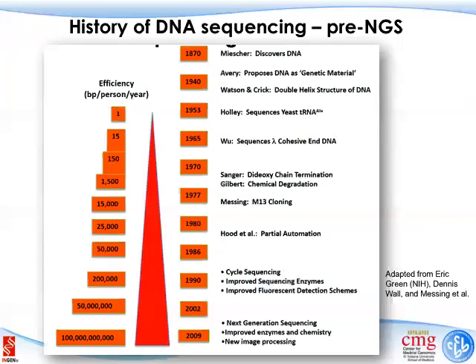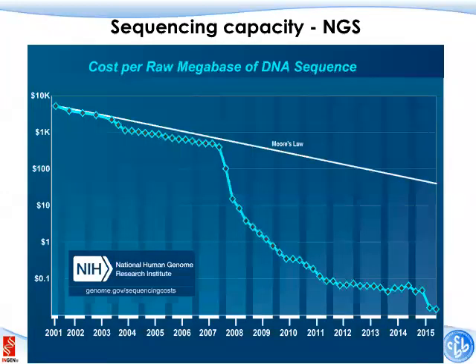And then here is the sequencing capacity. In the 1950s, each year, one person's ability to decipher the genetic variant sequence is about 1 nucleotide a year. And then fast forward to the 1970s, that is where the Sanger sequencing and other types of sequencing were being invented. So you can see that one person in a year can get to about 1,000 to 10,000 bases. And then we are talking about 1990, the beginning stage of the Human Genome Project. It's about 200,000 nucleotides per year per person. And then in 2009, there's more zeros than I can count. And today there's a few more zeros afterwards. But the point is our sequencing capacity certainly increased dramatically.